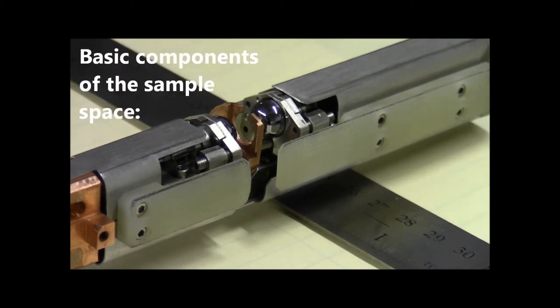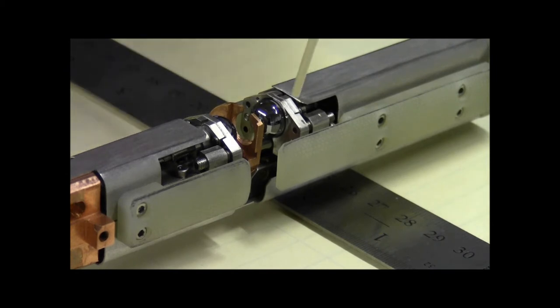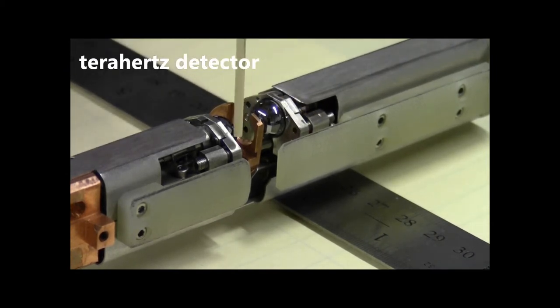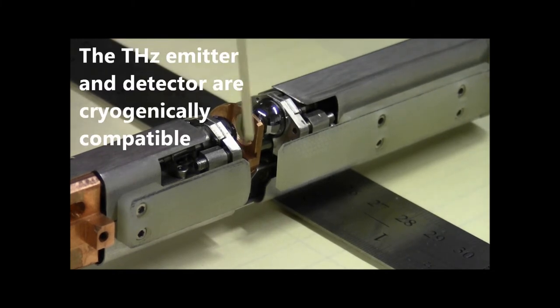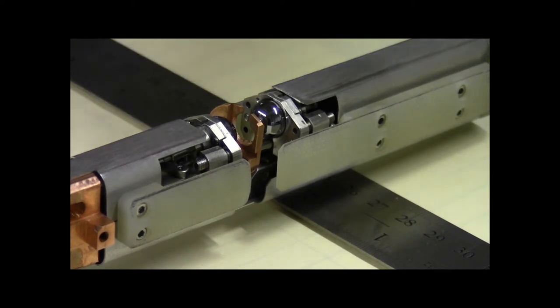The basic components you're going to see here are the terahertz emitter, the terahertz detector, and the sample tray. Terahertz frequency light is passed from the emitter through the sample to the detector for our transmission measurements. Both the emitter and the detector are cryogenically compatible, so they're sitting inside of a four kelvin to 300 kelvin flow cryostat. They need to be able to operate at those temperatures and in the nine tesla magnetic fields.